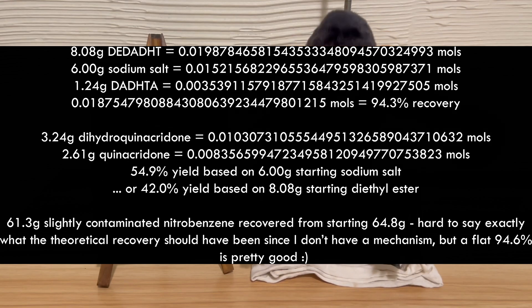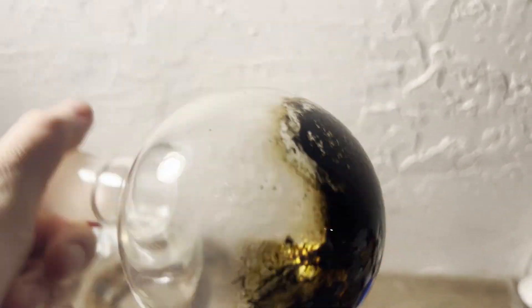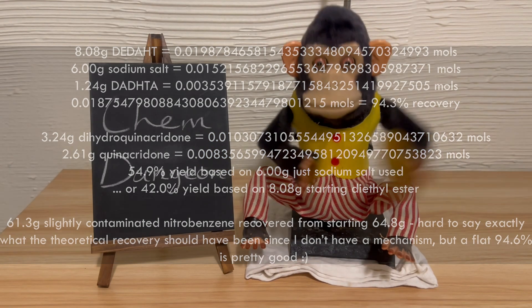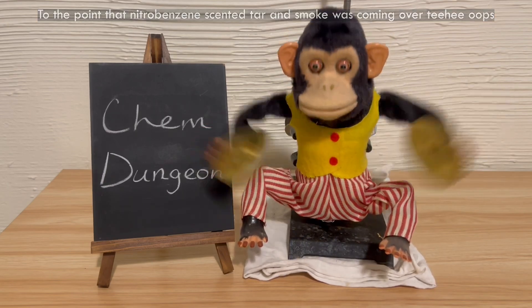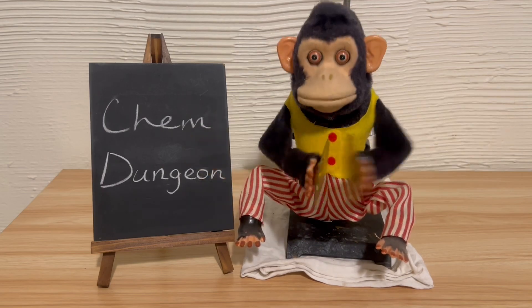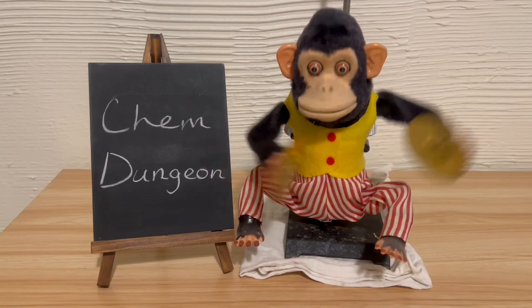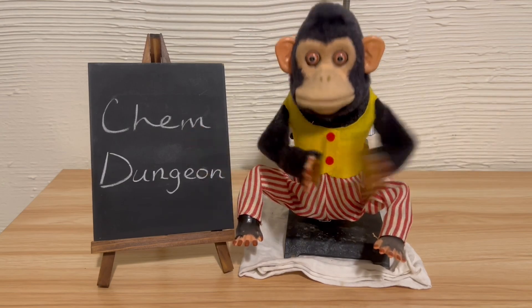I wanted to see if I could recover any quinacridone that might still have been dissolved in the nitrobenzene, so I distilled it off and got this absolutely beautiful tar. Given the thermal stability, any quinacridone that might have been in it shouldn't have decomposed, but I'm not completely sure since I let the distillation go a little longer than I should have. I'll be making a lot more quinacridone for a future video, so I'll find out whether any was dissolved by better monitoring the distillation then. I don't have enough nitrobenzene to conveniently process the large amount of DDAT I made in the previous video without too many batch-wise reactions, so I have at least two ideas to try.